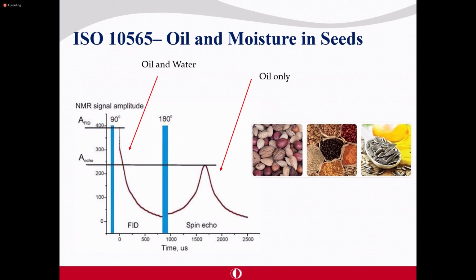But the important thing here is we usually cannot use this approach for measuring the moisture content of all foods.